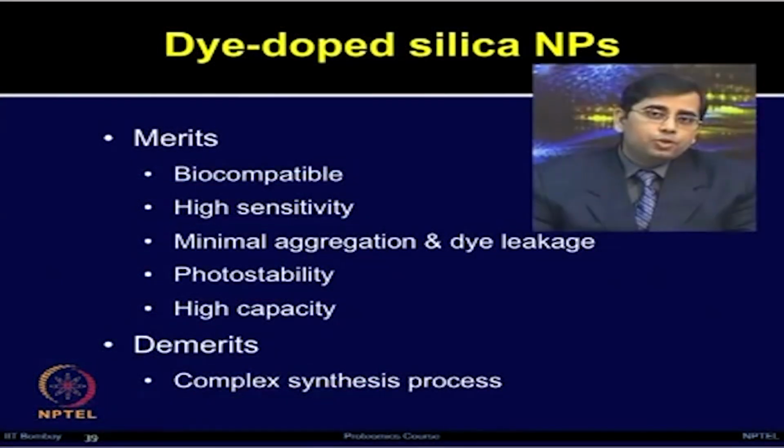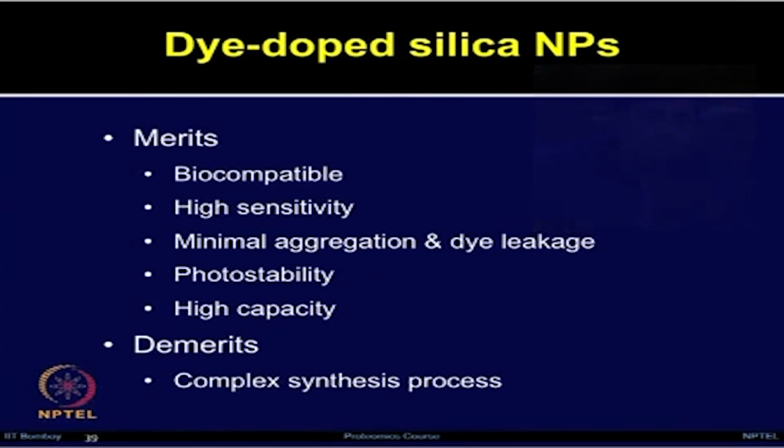Its various merits include biocompatibility, high sensitivity, minimal aggregation and dye leakage, photostability, as well as high capacity. The demerits of dye-doped silica nanoparticles include the complex synthesis process.